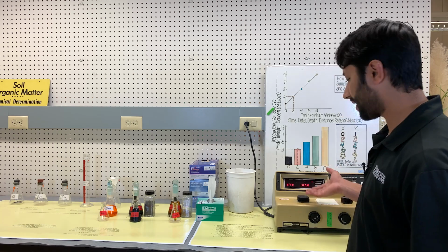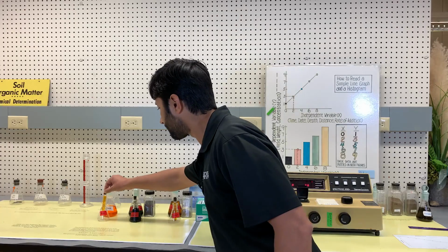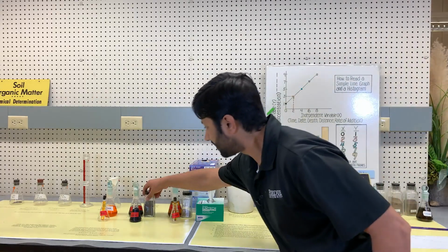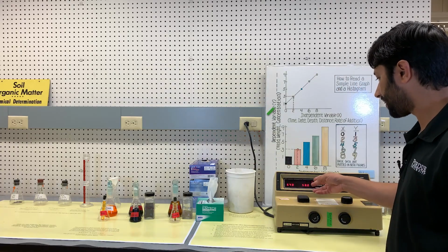The blank should read 100 transmittance. And then this is the Forstmann soil, and the Forstmann soil has more organic matter. You can see that the soil color is darker than the Claremont soil. So our reading is 58.